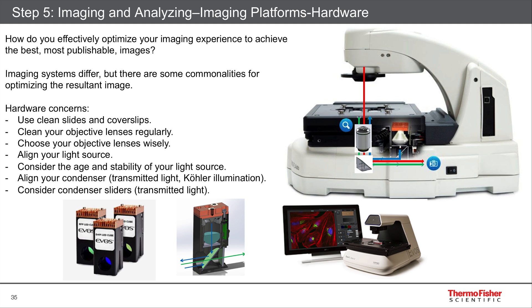Built into each light cube are the excitation and emission filters for that family of dyes. For instance, a GFP light cube will have filters for GFP or fluorescein. This is an inverted microscope, so all the fluorescence optics are below, going up to the sample and back down to the camera. Notice there are no eyepieces — you image through the monitor. At the top is one of our EVOS FL-AUTO automated microscopes, and at the bottom is our brand new FL-AUTO-2, the newer version of our automated microscope.